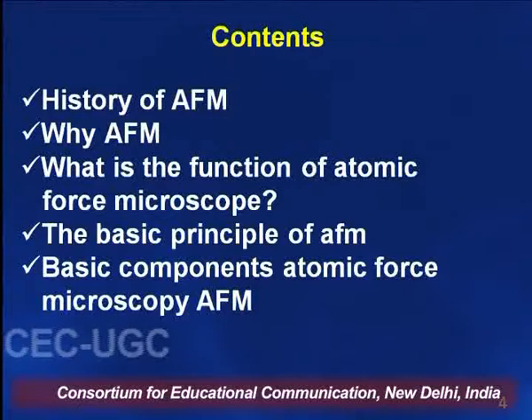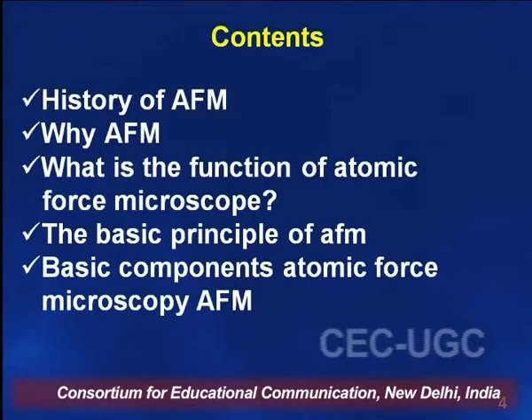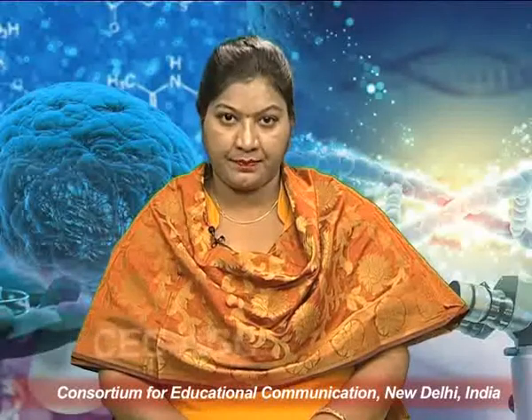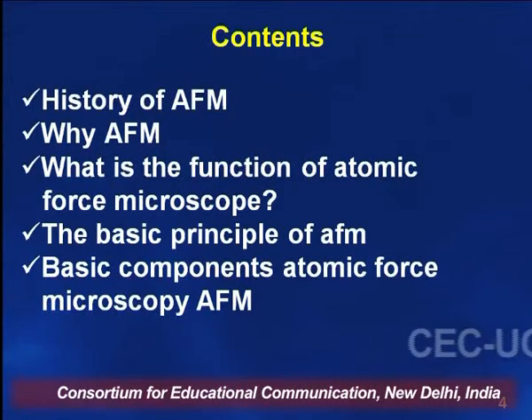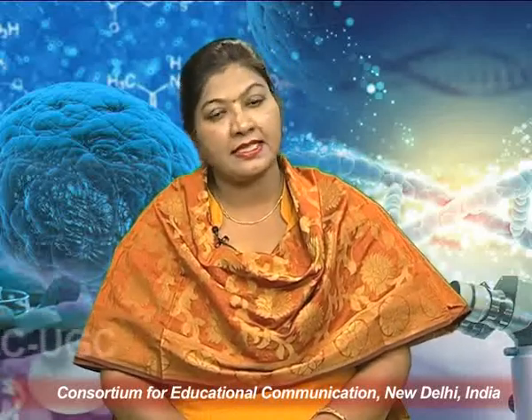What is the history of atomic force microscopy? Why do we use atomic force microscopy, means what type of characterization can we do through the AFM? What is the function of atomic force microscopy and the basic principle of the AFM? And what are the basic components used in atomic force microscopy where we can get the imaging or the surface scanning? So we discuss one by one.